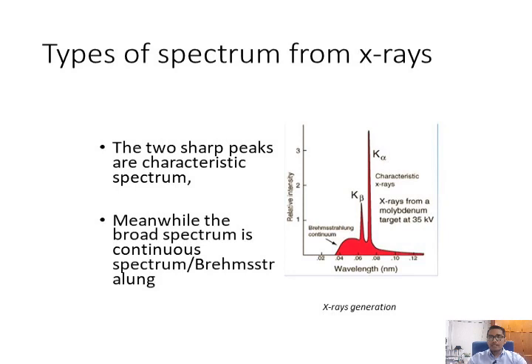Bremsstrahlung normally is an unwanted spectrum in that it contributes to the noise of the reading in the spectrum. Bremsstrahlung normally appears as a broad spectrum, indicating non-crystalline materials.